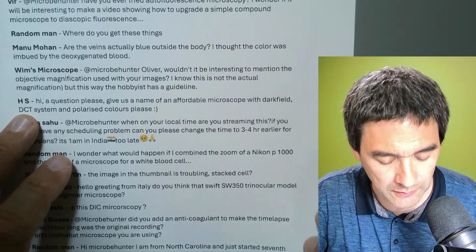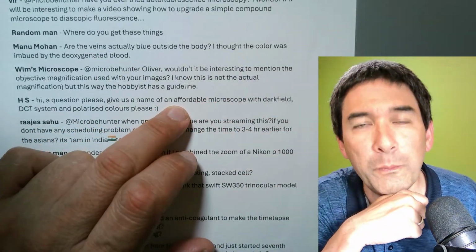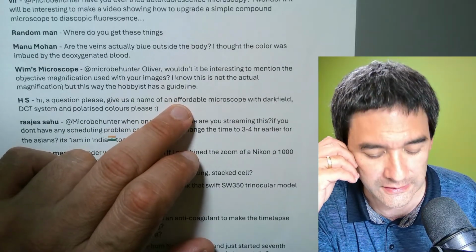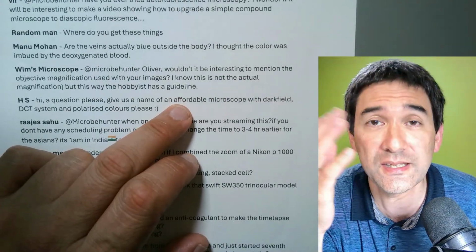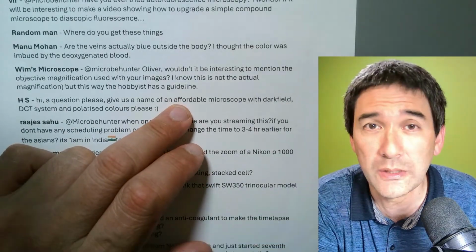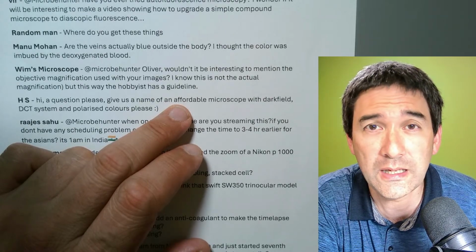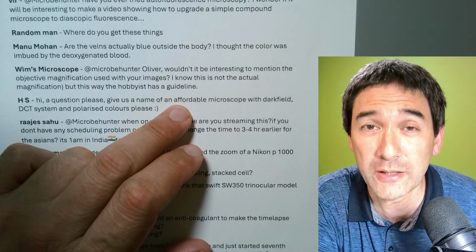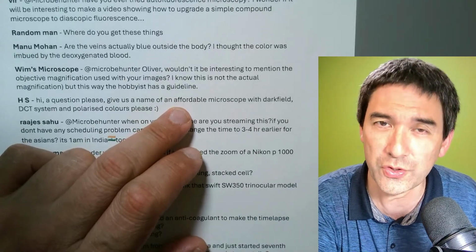What's affordable? Again, microscope buying is a little bit, how do you say, the opinions go apart very much. If you just read the forums a little bit. I in the past have been recommending microscopes for hobbyists around, let's say, 300, 400 euros. Dollars, euros. There is no limit further up, but generally, if you say, okay, get a microscope like this, then some people are going to say, well, actually, no, you shouldn't. You should get yourself a used microscope of a brand company. Then other people, again, have a different view. So there are so many different views on this.